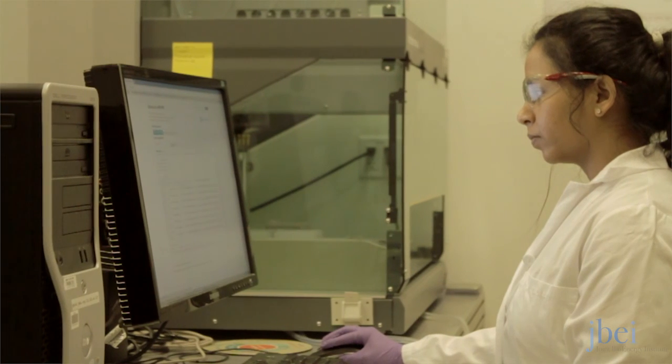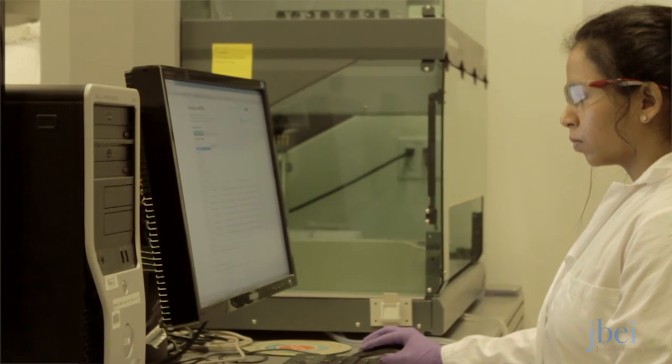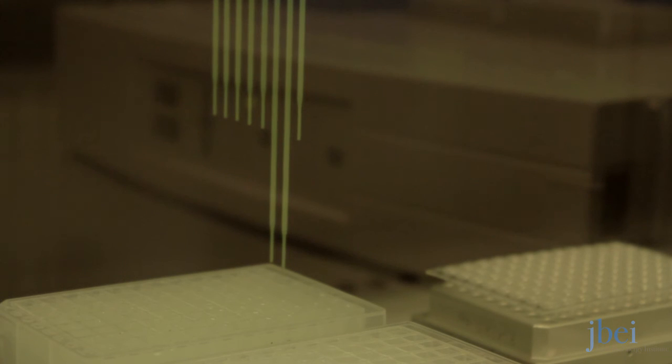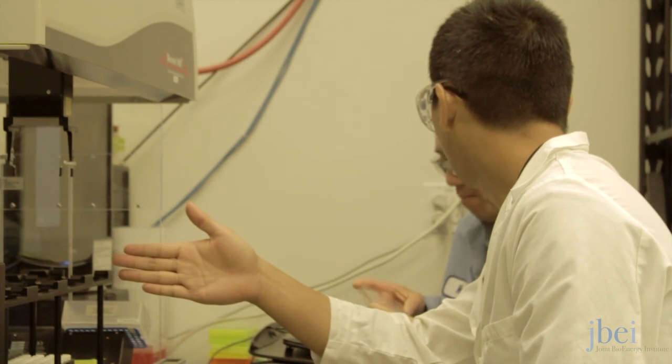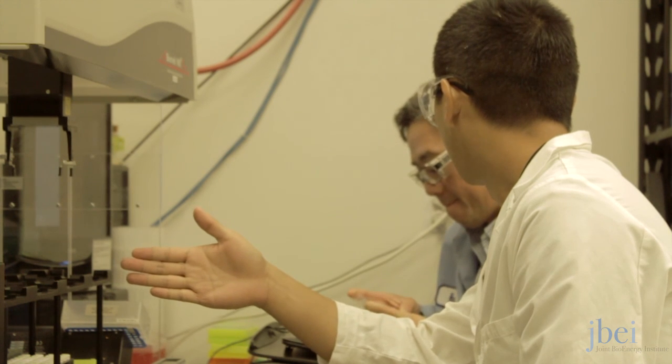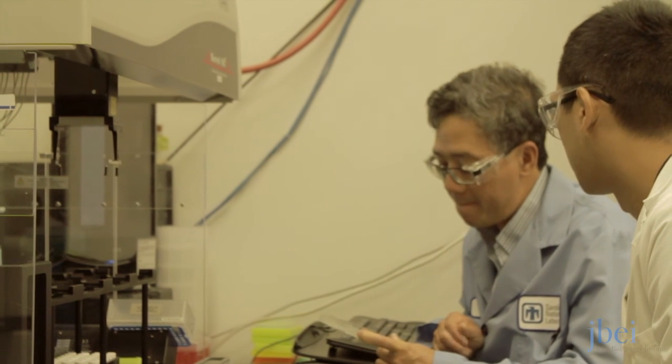So what we've been doing this very week, and we're halfway through it, is all of our developers, say 10 to 15 of them, have gone through all of their safety training, and now they're going into lab, and for a week they're doing an end-to-end molecular biology experiment. So they're getting hands-on experience, and now they have a visceral understanding of what it is that their software is trying to help and support and to automate. So they're doing things like mini preps or PCR, or doing transformations, cloning, all these types of things. And I think for them it's a lot of fun, but they're also starting to understand the real world environment in which their software is helping out.